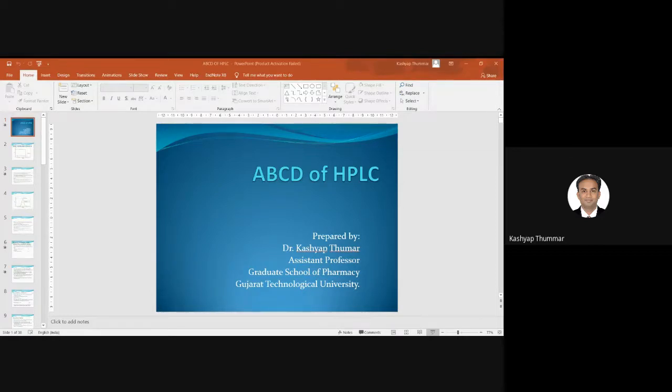Okay, so retention time is denoted as TR. The time between the sample injection and peak maximum is called the retention time. And the retention time of an unretained component, or the first baseline disturbance by the sample solvent, is called the void time or hold up time.